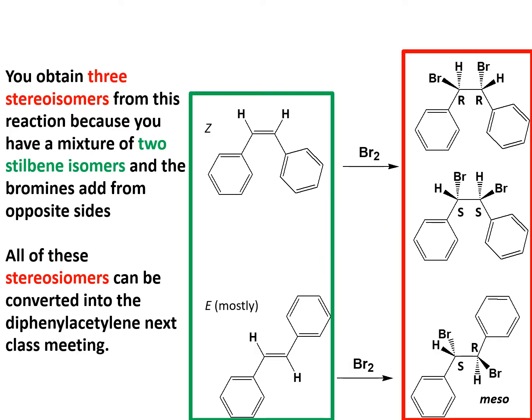One important chemistry here is that, if you remember last time when we synthesized stilbene from benzaldehyde, the products were isomers. Because of that, if you use a sample of stilbene, then there is an equal chance that either of these stereoisomers can react with a given reagent to produce other stereoisomers.